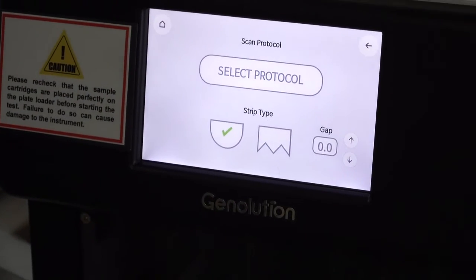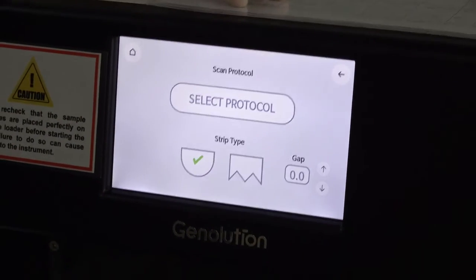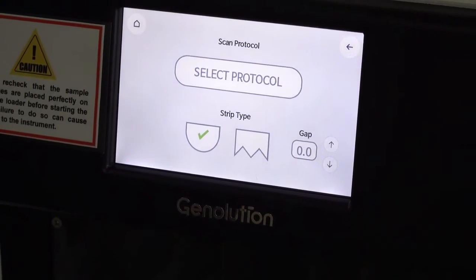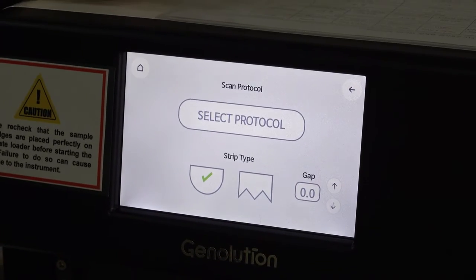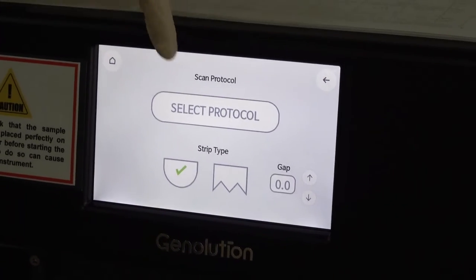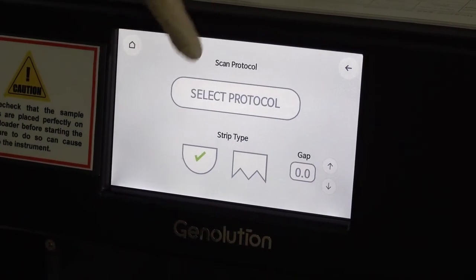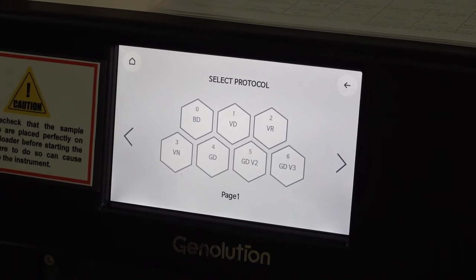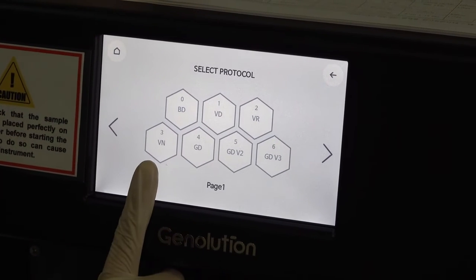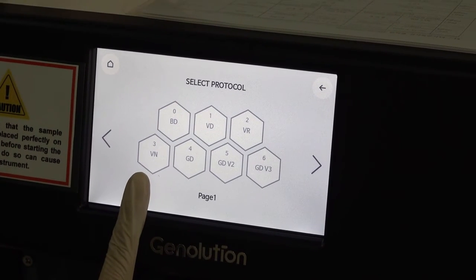The protocol which you select is for the semi-circular symbol over there. You will see it with a tick mark, a green tick mark. You click on that and you select the protocol. Subsequent to that, our protocol will select the specific kit with the instrument.